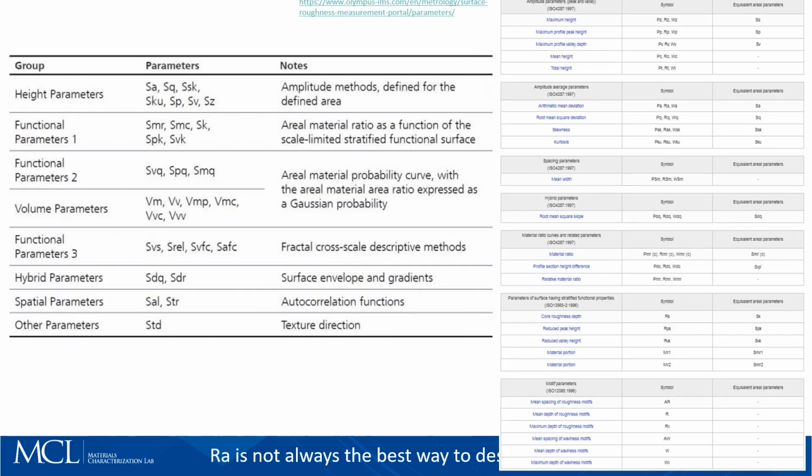There are a lot of standardized surface texture parameters out there that can be used to differentiate surface topography beyond average roughness, RMS roughness. And a lot of times these give a lot more insight into the difference between surfaces than just roughness. Yes, roughness is great if, say, I'm polishing a sample for nano indentation and I have to have a certain RMS roughness. But if I'm trying to tell the difference between 2 surfaces, as we saw with those lines, it's not always the best way to do it.